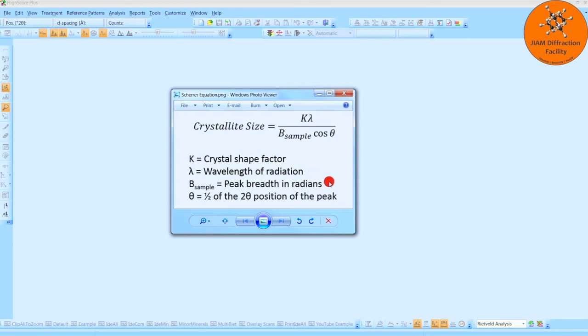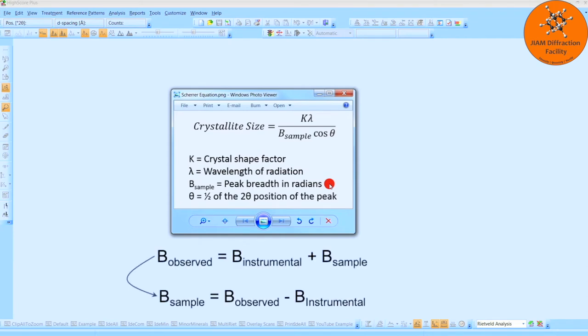B sample is the peak breadth in radians. And just to be clear, this is not the broadening that you see in the diffraction pattern, because the broadening in the diffraction pattern is caused by the sample broadening plus the instrumental broadening. So this one here is just the sample broadening.